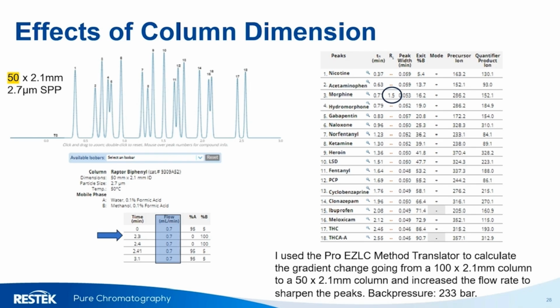Overall, the separation is pretty good. I've got good separation between my isobars, a couple of doublets that are less resolved than I like, but generally overall a workable chromatogram.